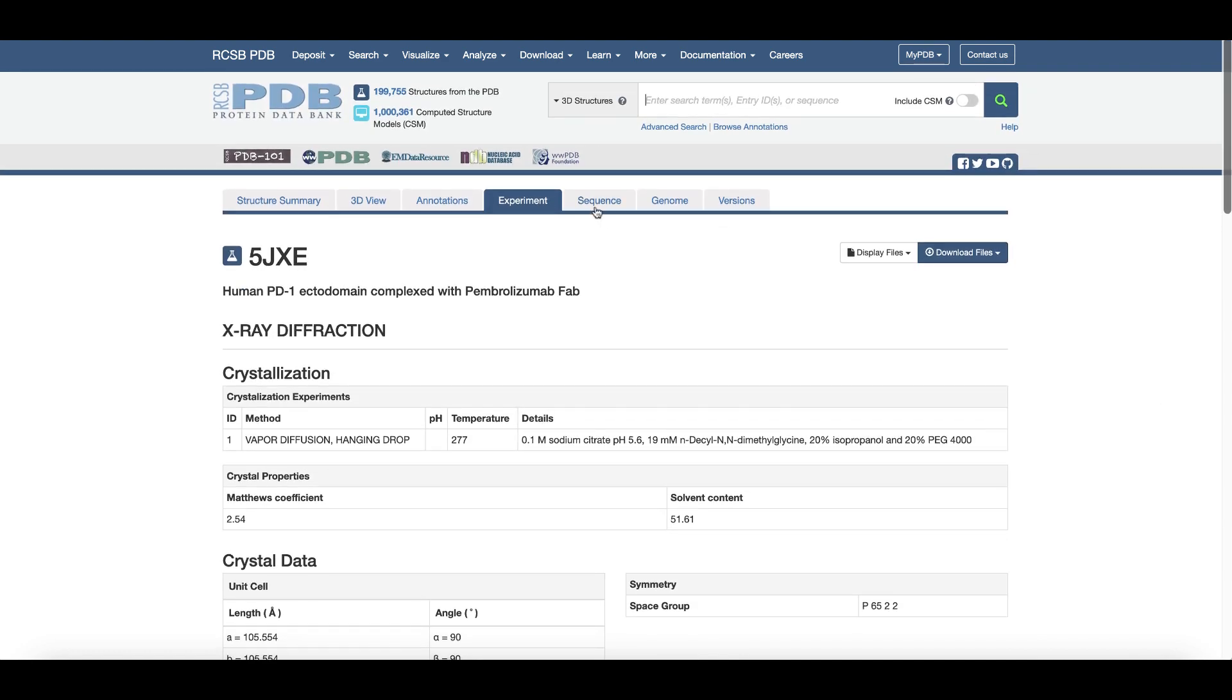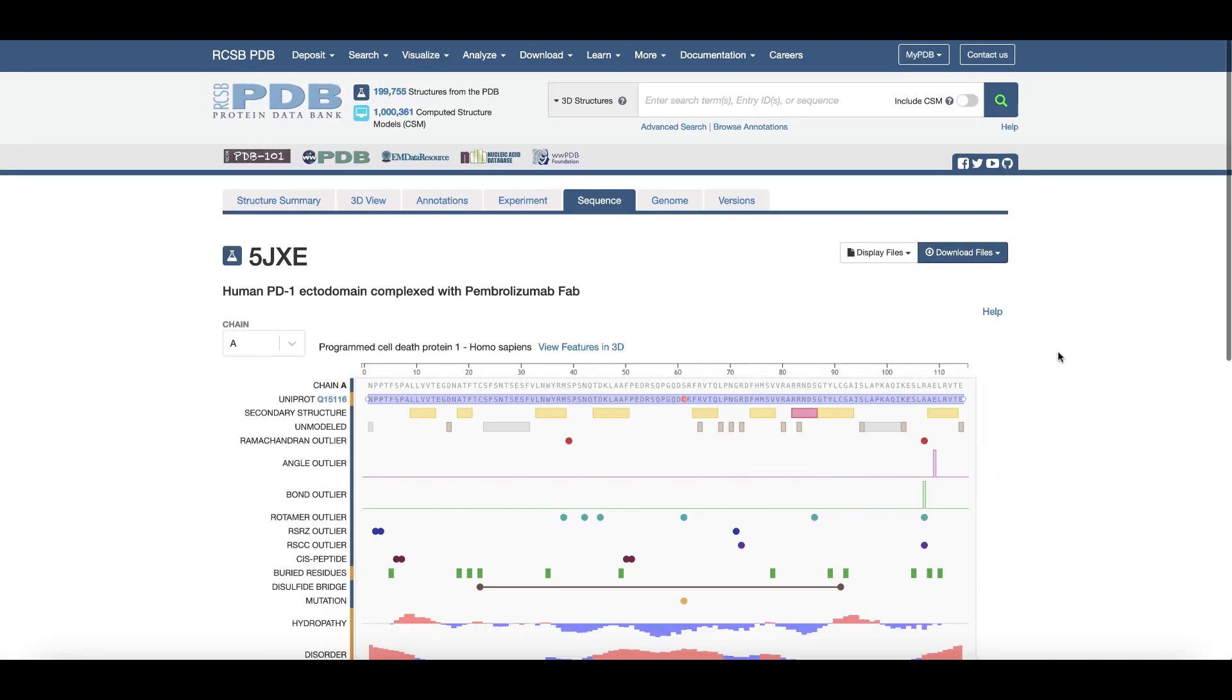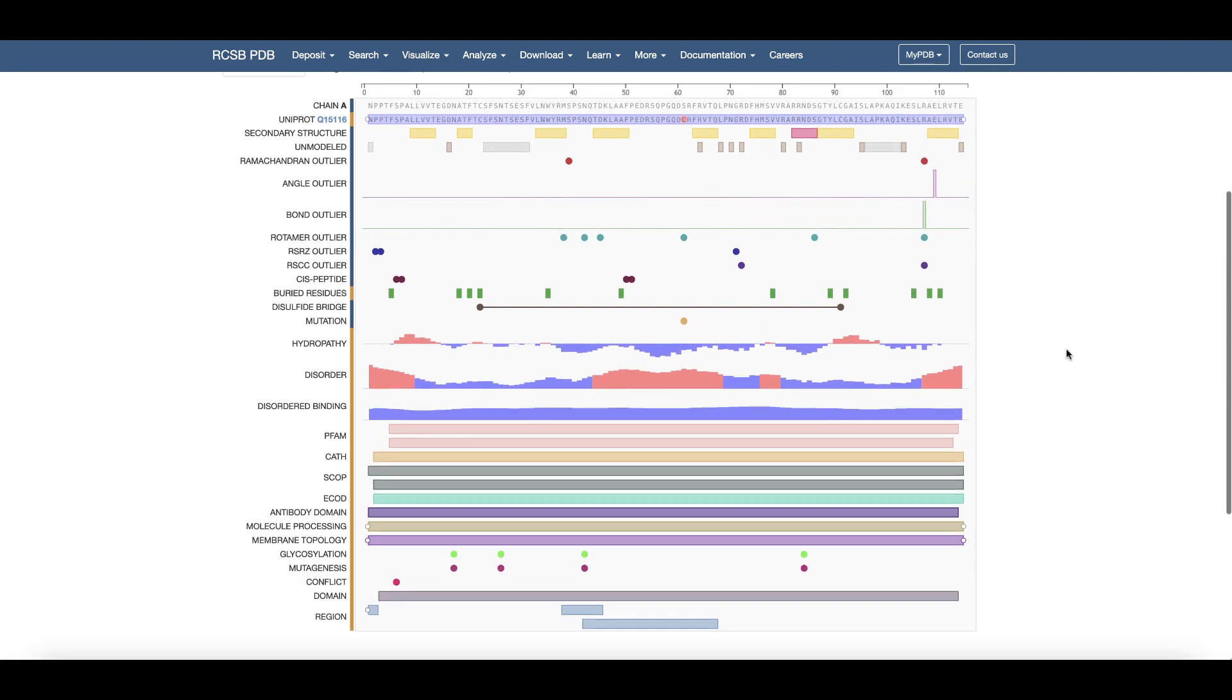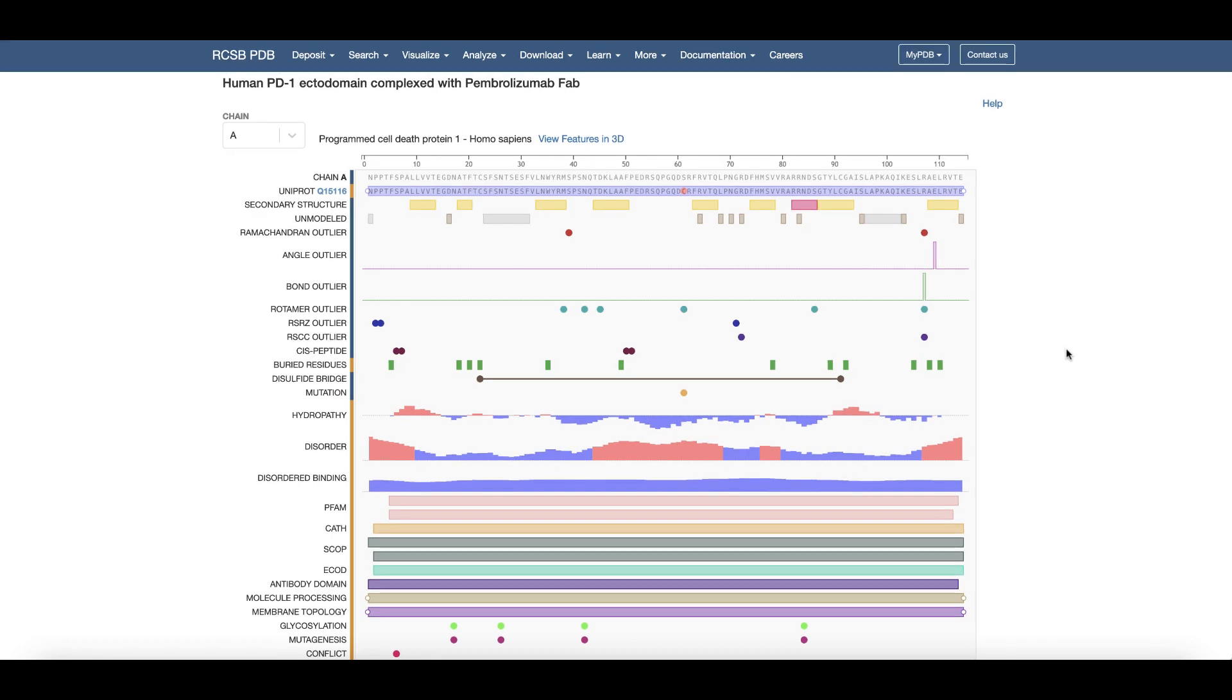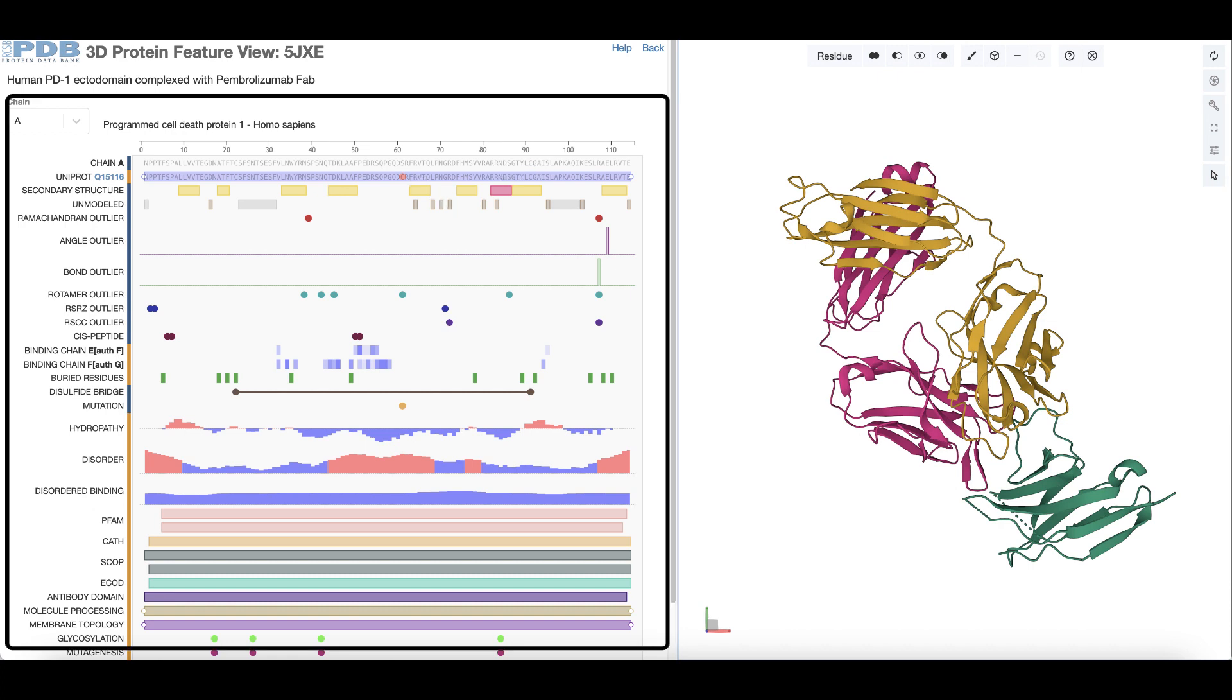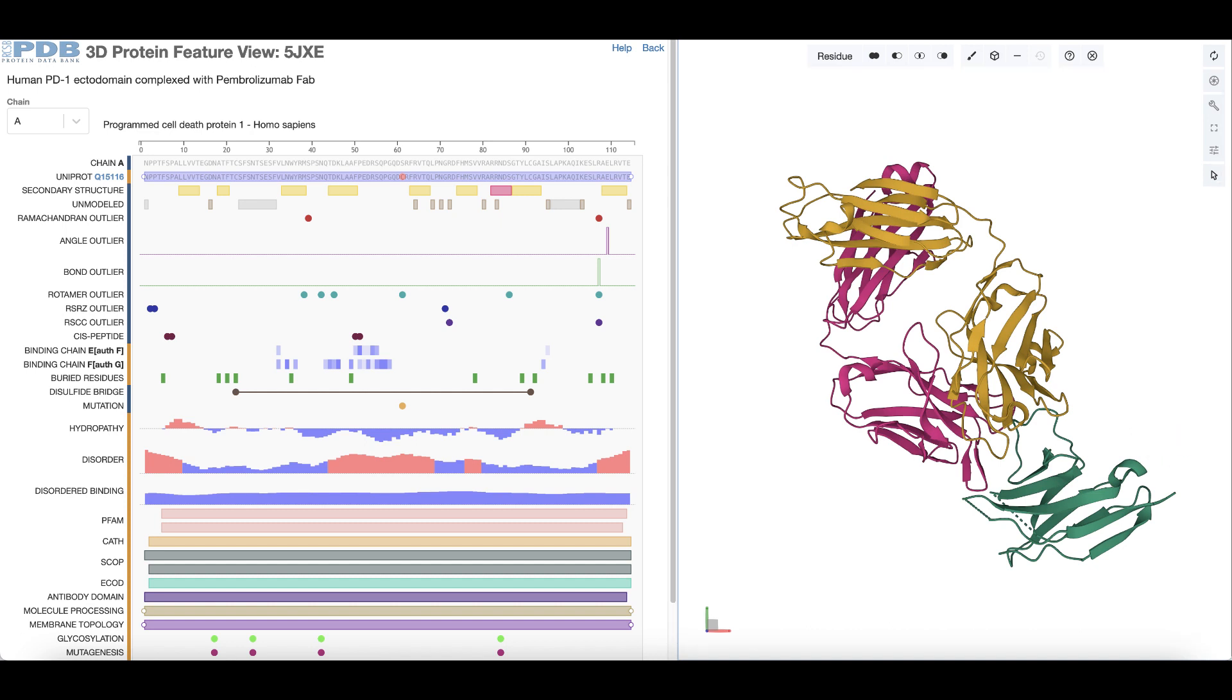The sequence tab maps important structural and bioinformatic features of each protein in the structure onto their respective polymer sequences. To examine these structures and integrated information interactively, open the 1D-3D view. If you click on a residue or a polymer segment associated with a specific feature in the 1D panel, the 3D panel highlights and focuses on the same residue or polymer region.